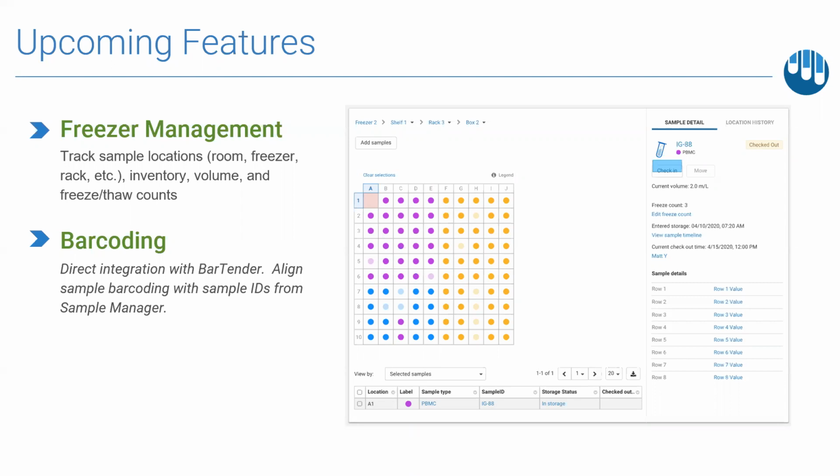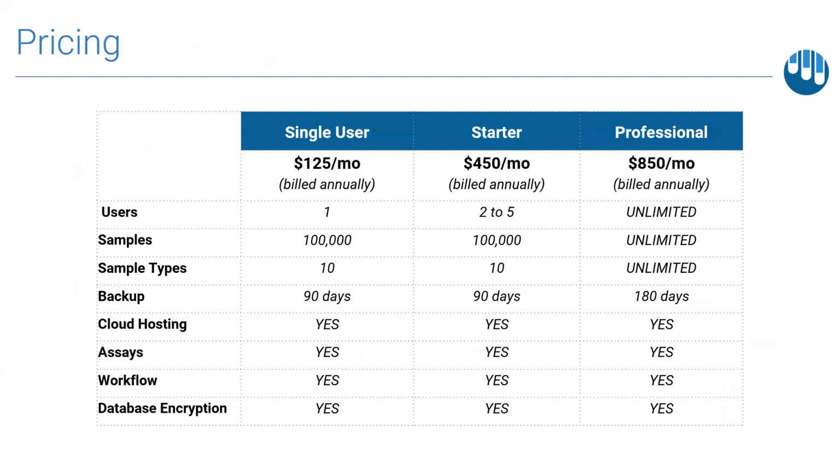So please keep them coming. Steve asked me if there were questions. A lot of the questions were coming in around pricing, so I'm sure you'll be interested to see what the pricing structure is.